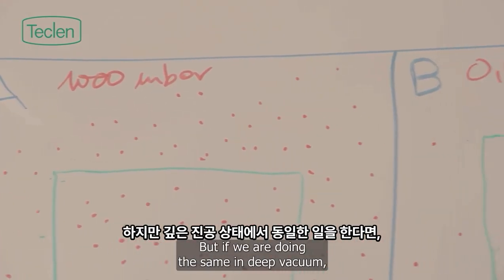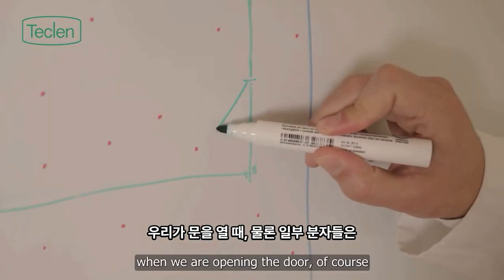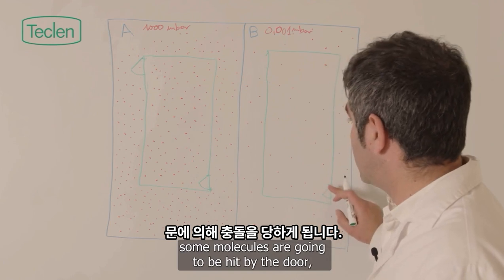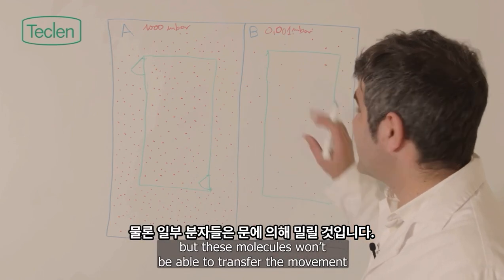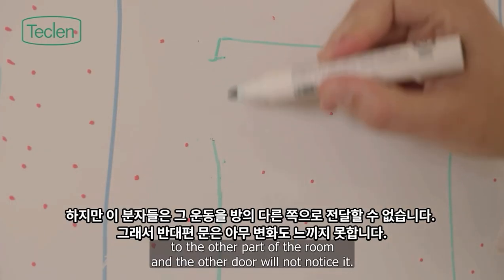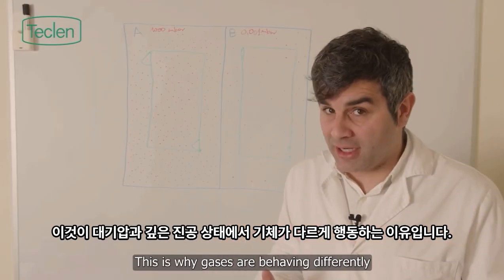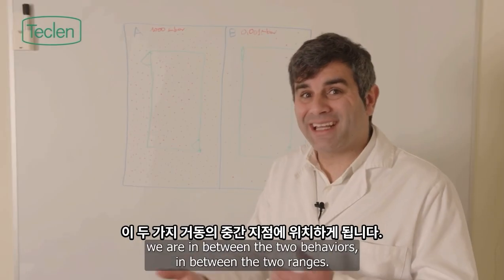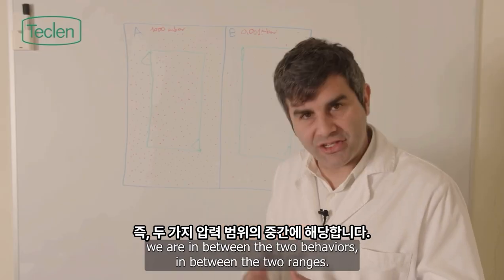But if we are doing the same in deep vacuum, when we are opening the door, of course, some molecules are going to be hit by the door. But these molecules are not going to be able to transfer the movement to the other part of the room, and the other door will not notice it. This is why gases behave differently in atmospheric pressure and deep vacuum. And in freeze drying, we are in between the two behaviors, in between the two ranges.